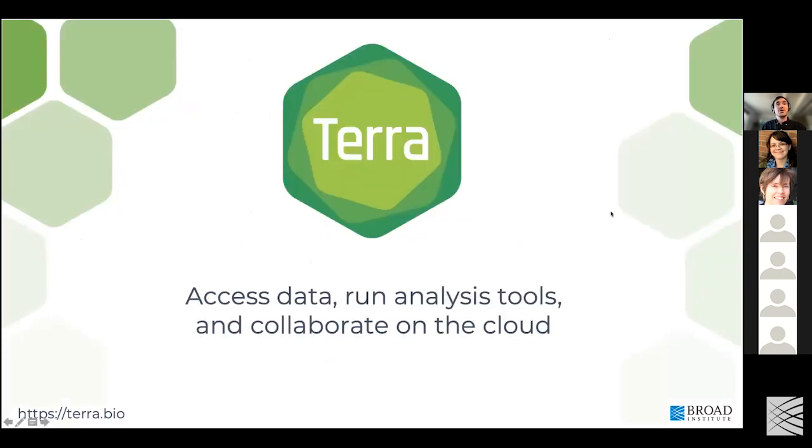So today we're going to be introducing you to a platform called Terra, and at its core, it is a platform for accessing data, running analysis tools, and collaborating on the cloud.